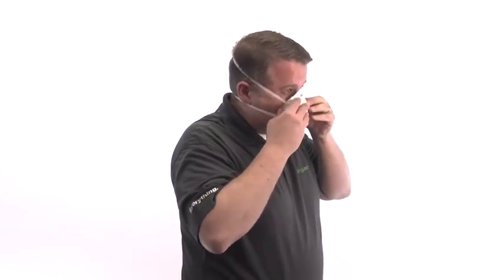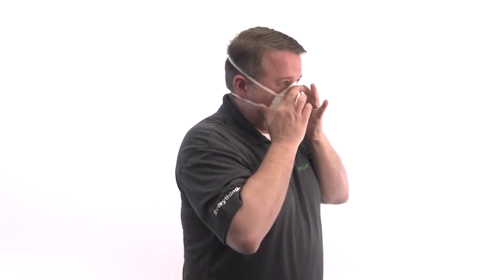Place your fingertips from both hands at the top of the metal nose clip if present. Slide fingertips down both sides of the metal strip to mold the nose area to the shape of your nose.